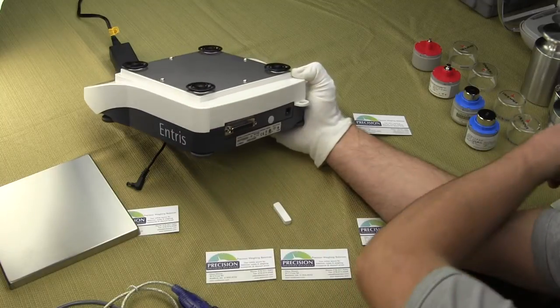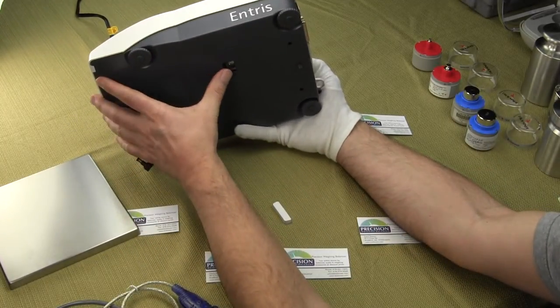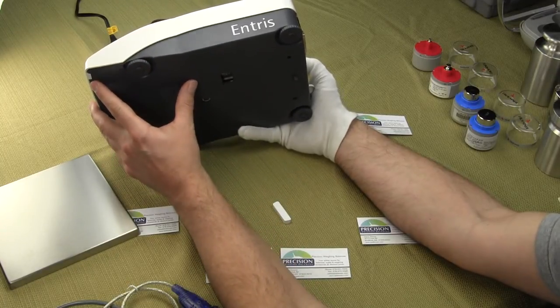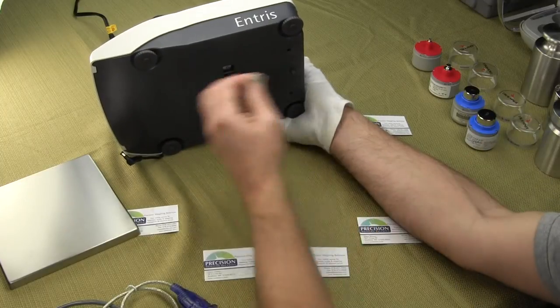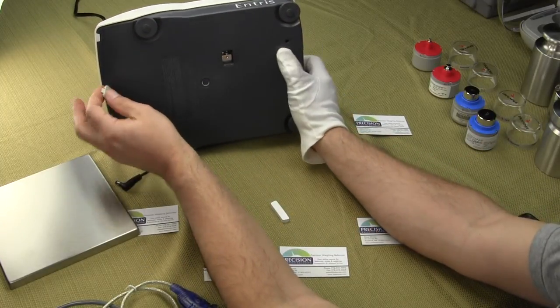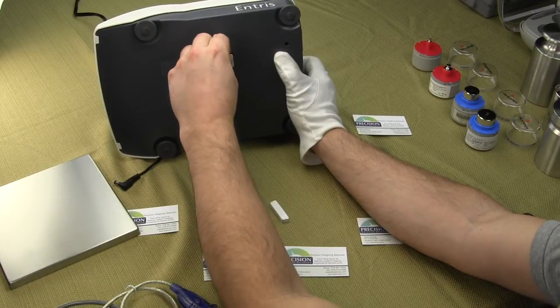This underhook hook is optional. You can also hang a wire on the balance if you want to do specific gravity. You have 4 adjustable feet, and if the underhook is not being used, there's this little door here which I'll put back on.